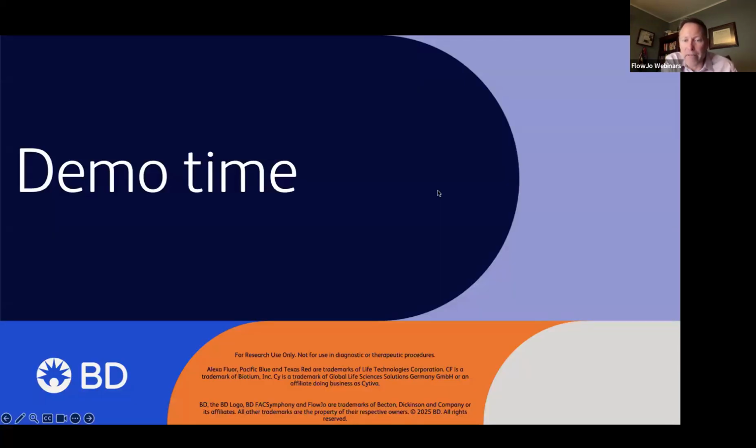And that is the end of the slides. So fingers crossed. That was why do we do compensation? What are your choices? How do you do it? What are the buttons in FlowJo to hit? And now let's actually do some in FlowJo.